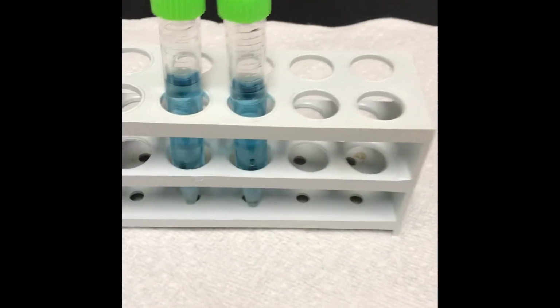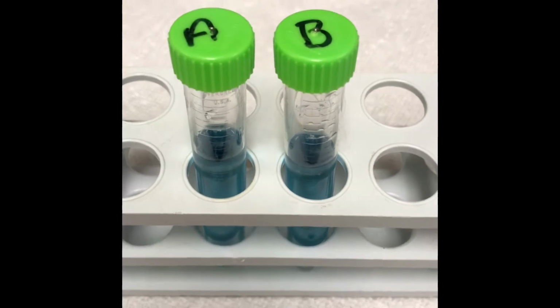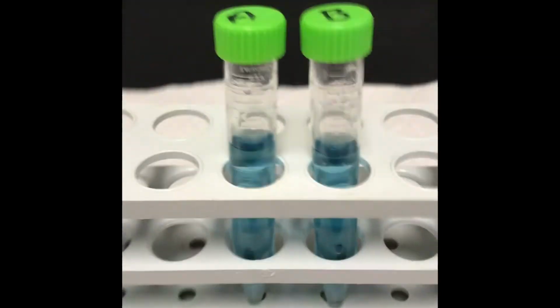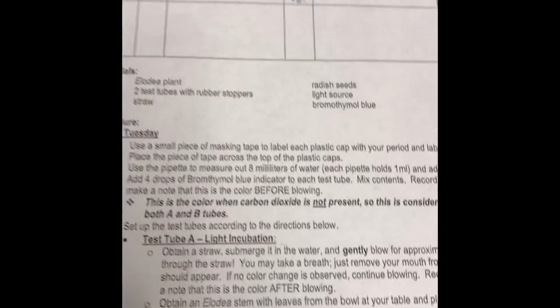Okay, so we have our 2 tubes ready to go. You can see the bromothymol blue is nicely diffused through the solution. So we have 2 blue tubes. There's my tube A on the left, tube B on the right. So I'm ready now to set up my 2 tubes.